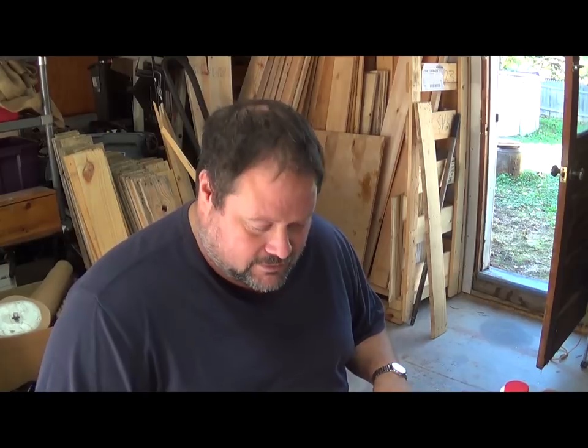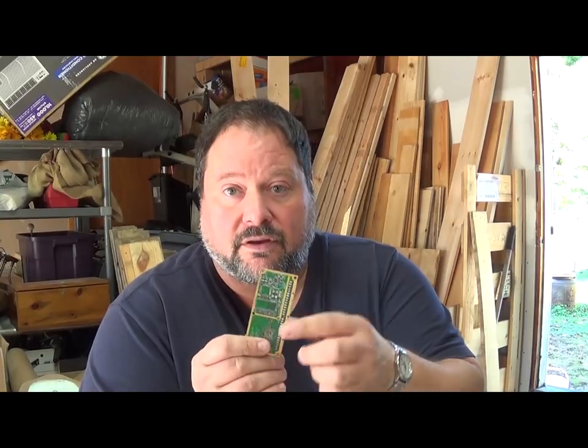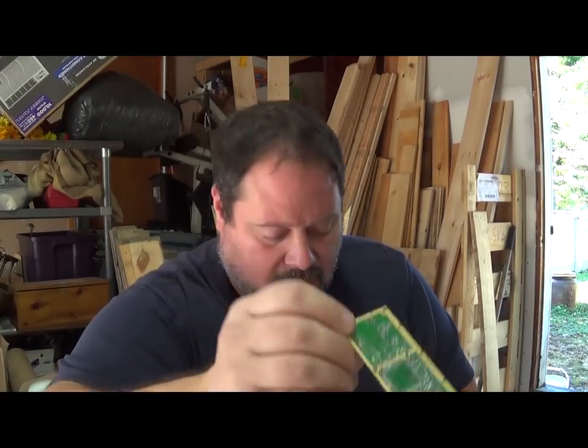Gold recovery is one of your favorite things on the channel. The next thing we're going to do is process this batch of mixed components. You want to make sure that they're all really clean and there's nothing left on them. Some people will throw the whole board in and sort it out later, but in my opinion it's just a lot easier to make things clean — there are fewer variables to screw things up, plain and simple.